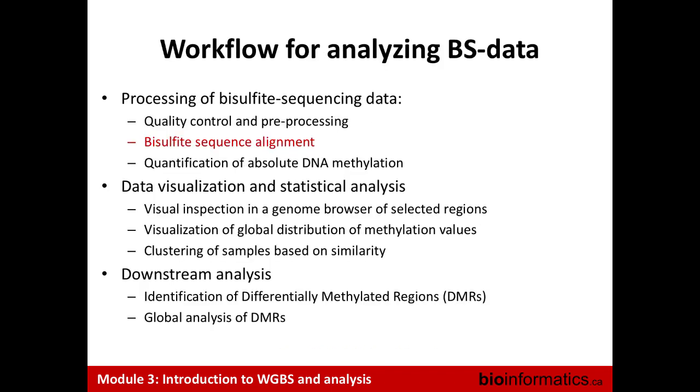Okay, so now off to the fun part. So far, this is sort of easy background. Before we start looking at the slides, why is bisulfite sequence alignment hard? I already kind of said it. Right, the reads don't quite match the reference.